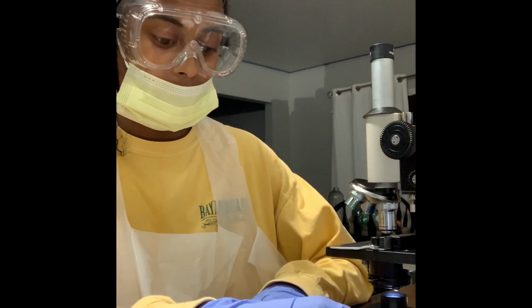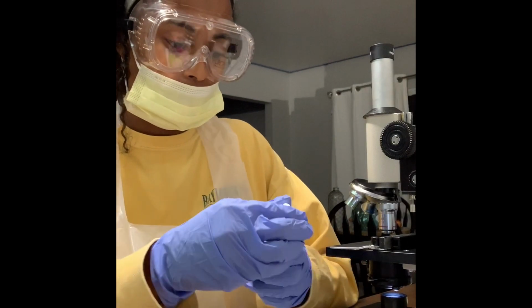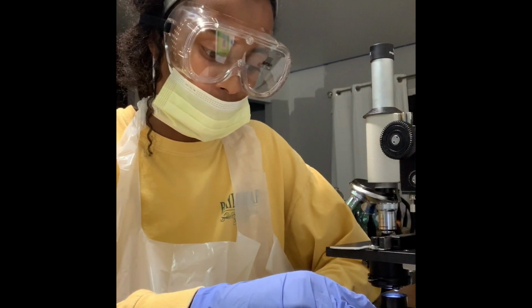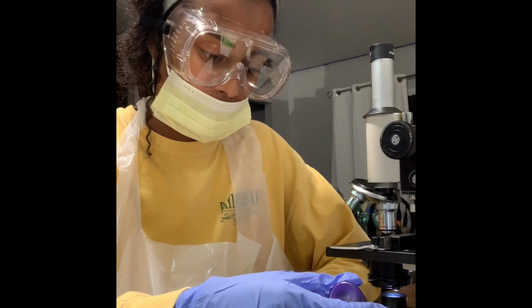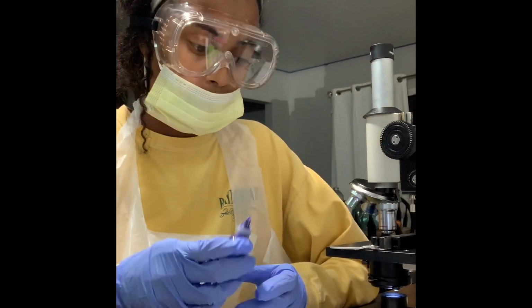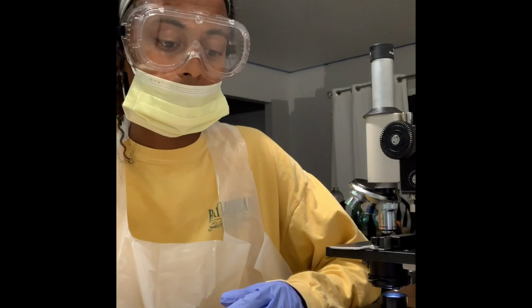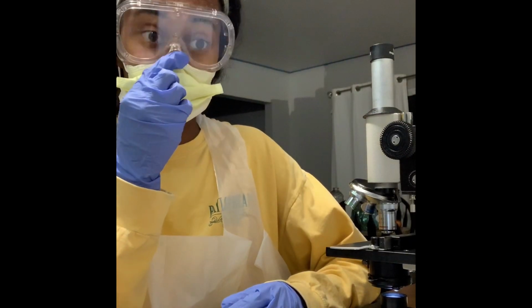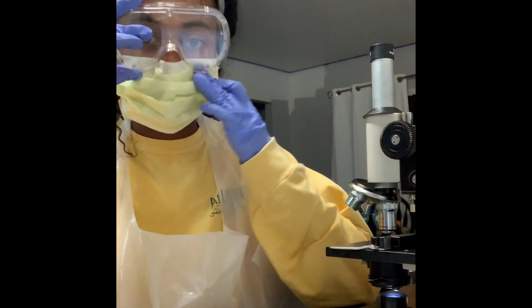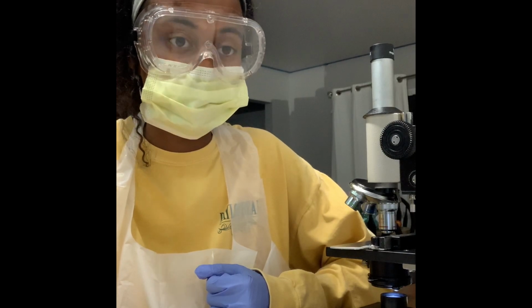Now that the 10 minutes is done, I am going to put my slide into the staining tray, add 1 to 2 drops of crystal violet into my circle where I swabbed my cheek. I think 2 will be fine, and I'll allow it to sit for 60 seconds. After the 60 seconds is done, then I will run tap water over the stain until the water does not run purple anymore.